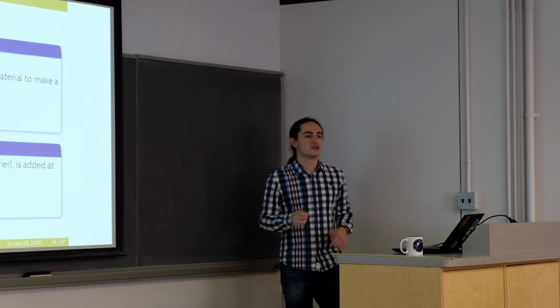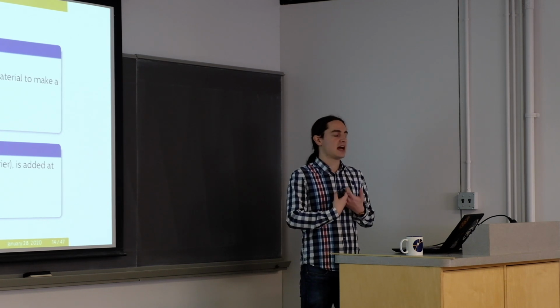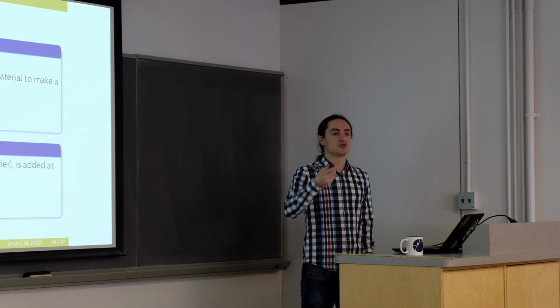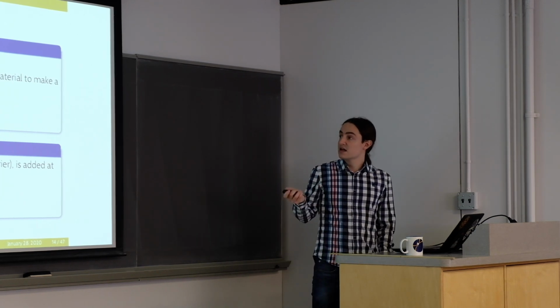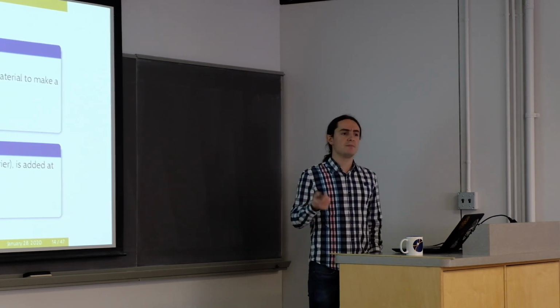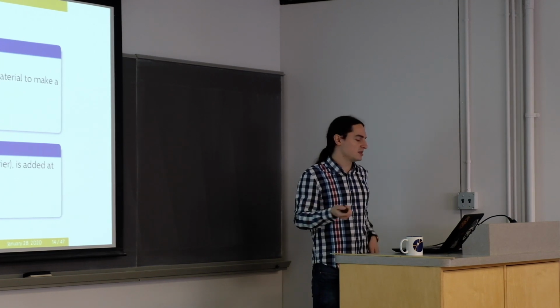Also, you can do two different approaches for AMS measurements. For some samples, you are interested in measuring the ratio. You typically have the stable isotope of the element in that material. So you want to measure the isotopic ratio of the radionuclide to its stable isotope. So in this case, you don't require 100% chemical efficiency in any step of the chemical preparation, because any loss in the radionuclide is going to be the same in the stable isotope, because that only depends on the element.